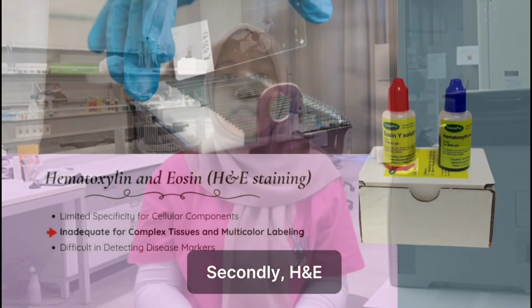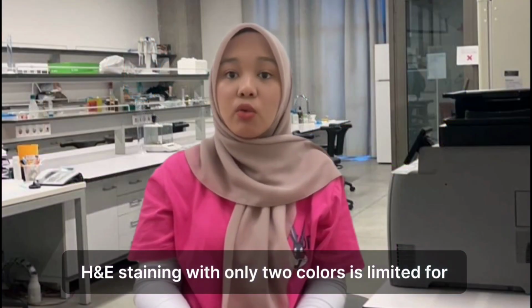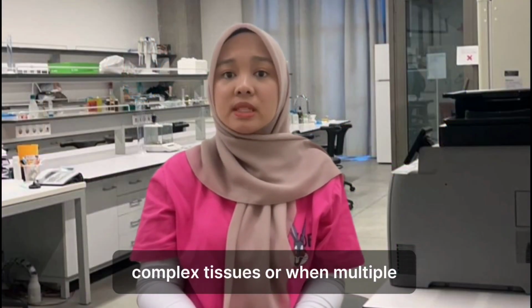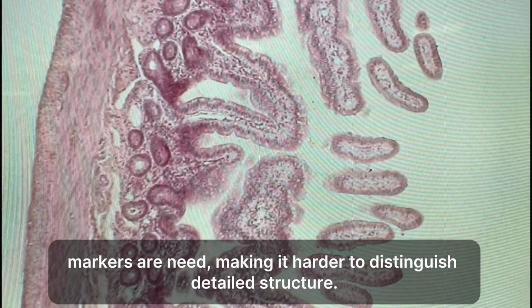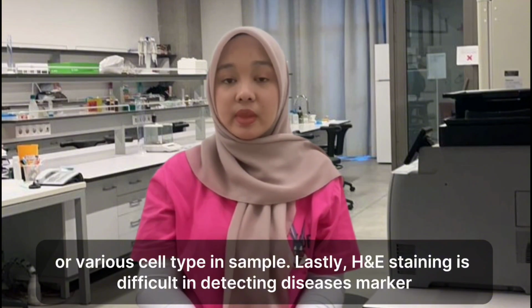Second, H&E staining is inadequate for complex tissue and multi-color labeling. H&E staining with only two colors is limited for complex tissue or where multiple markers are needed, making it harder to distinguish detailed structures or various cell types in a sample.